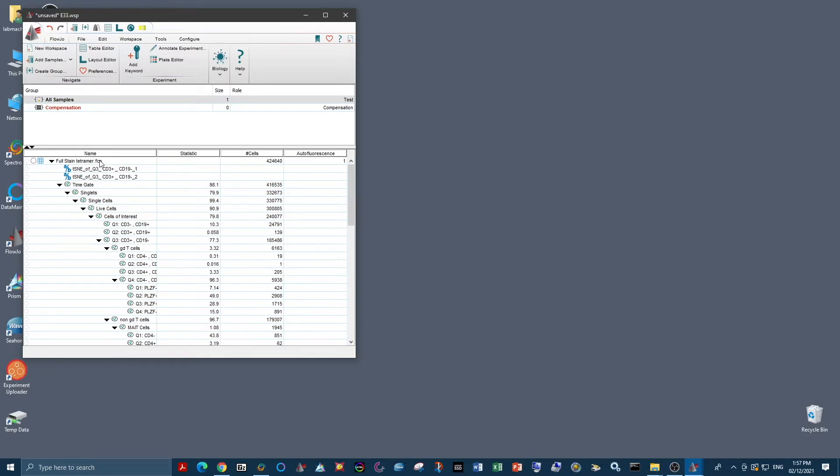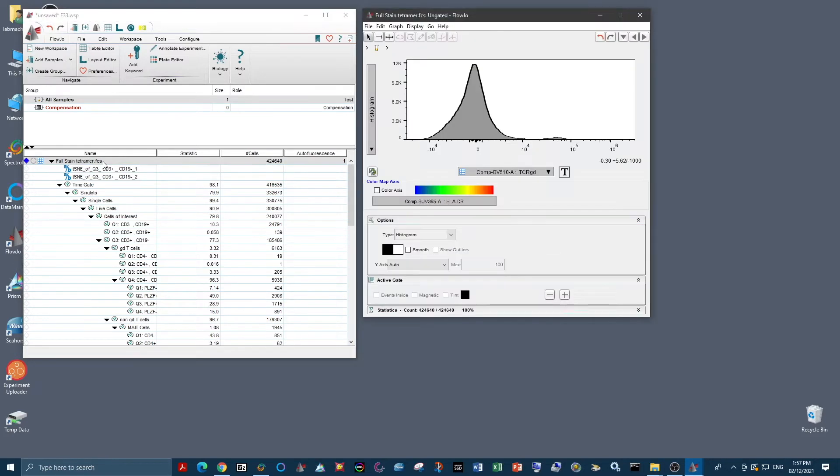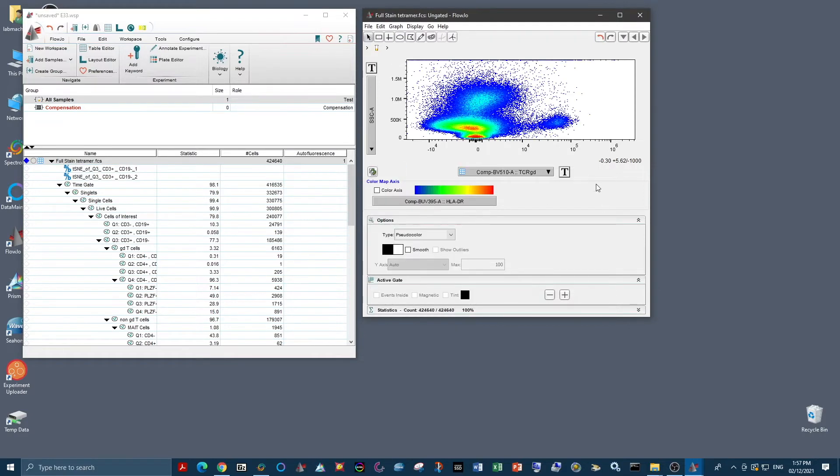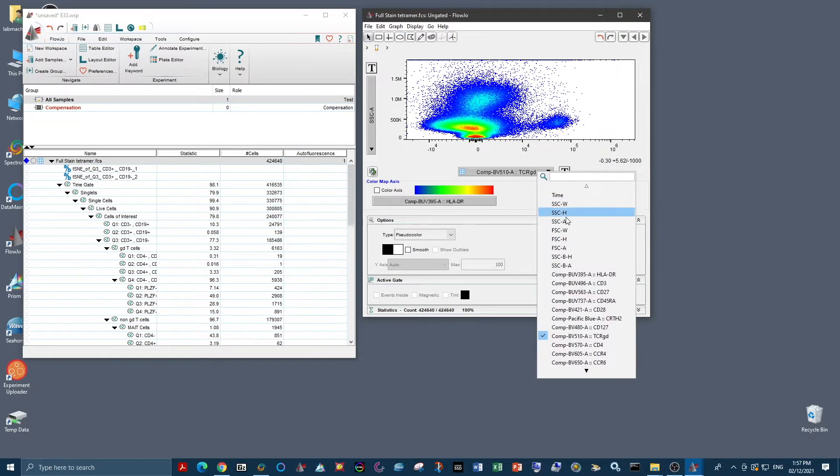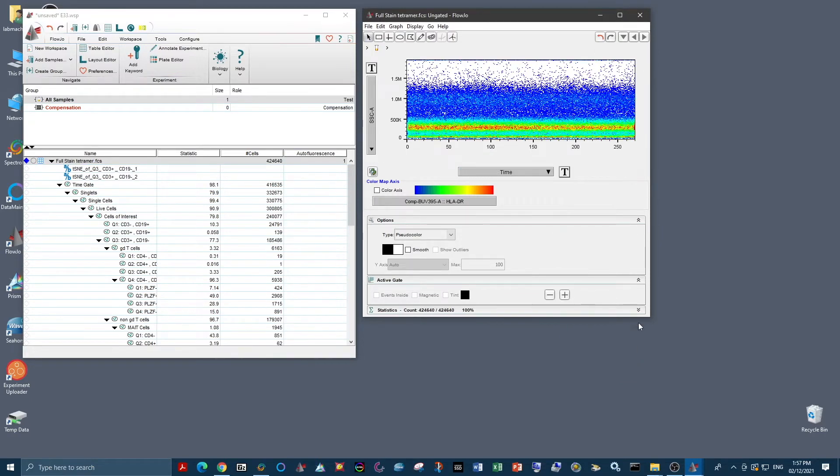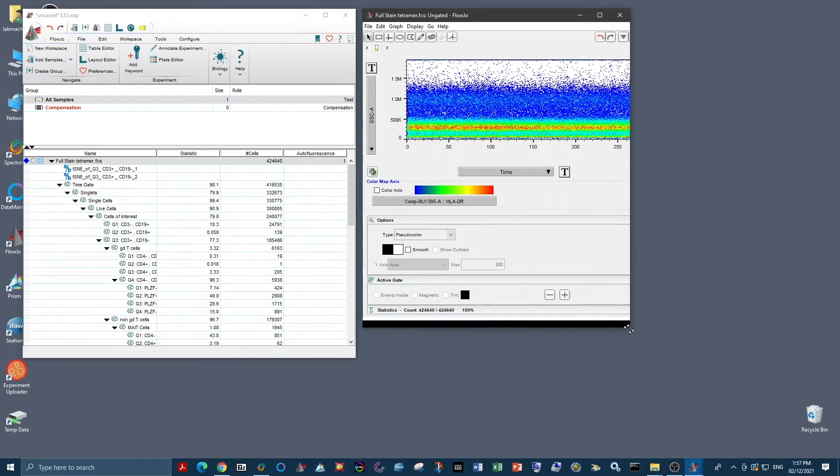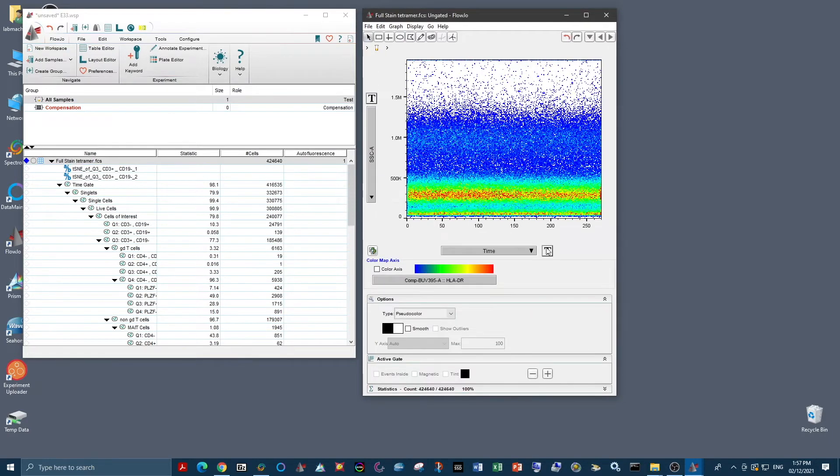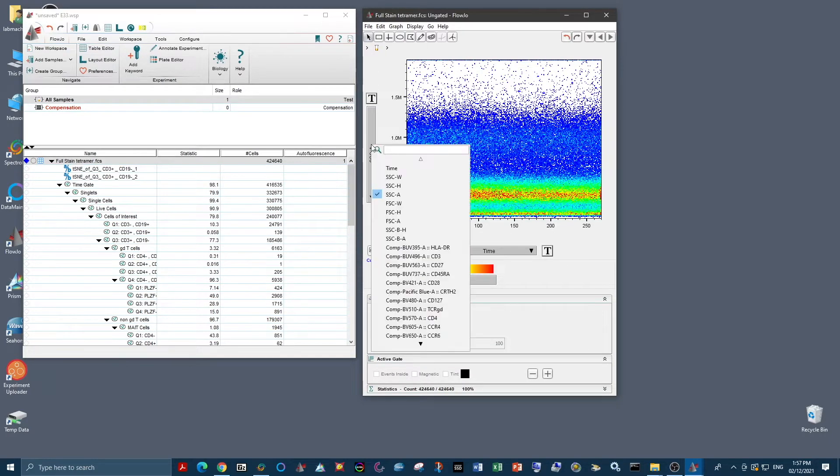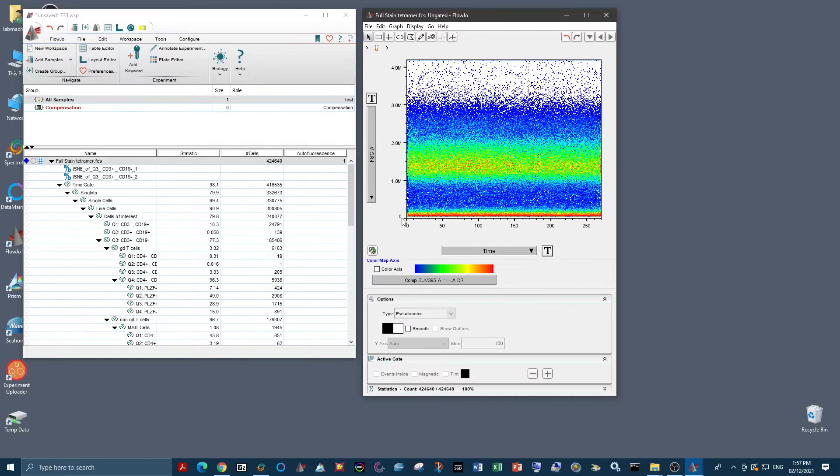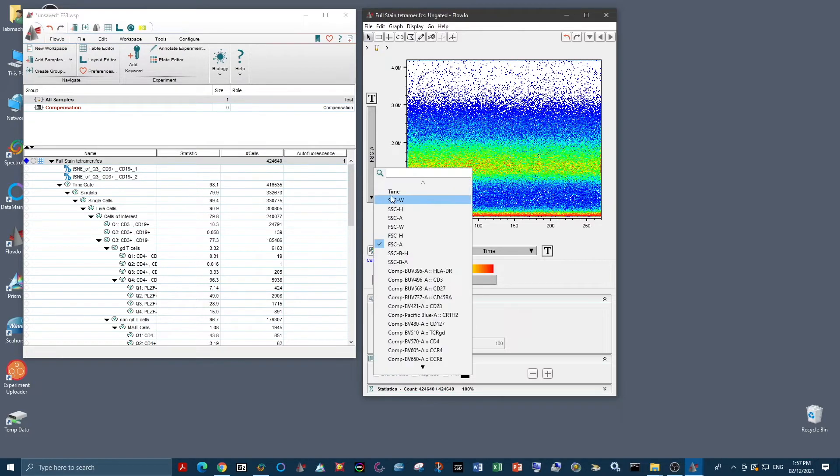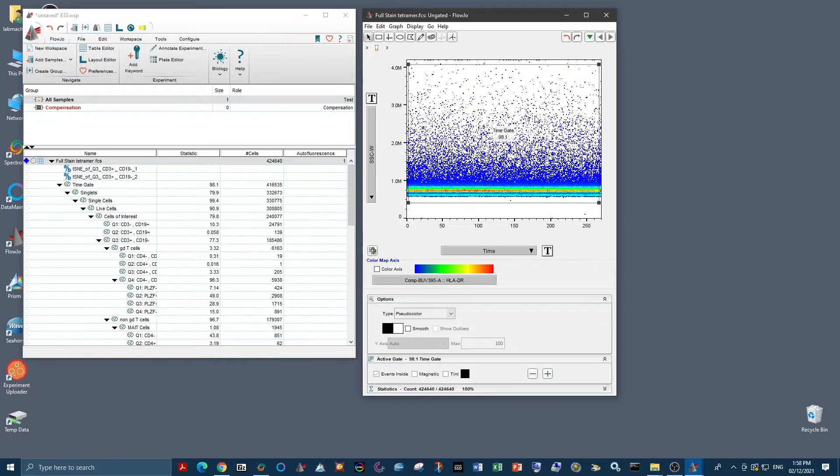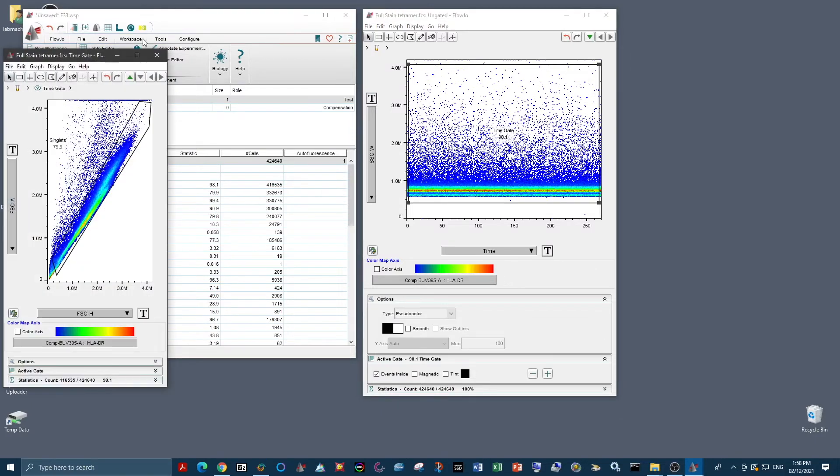So of course the first thing that we have to do is clean up our data. So we want to look at our time gate first to make sure that everything is recorded during stable flow and that we're only capturing events that were recorded then. So we've placed a time gate.